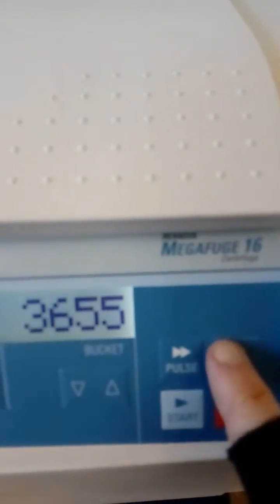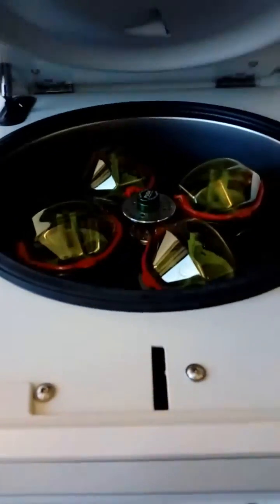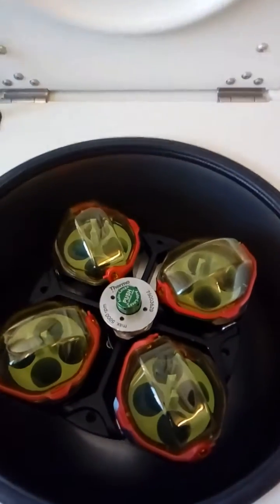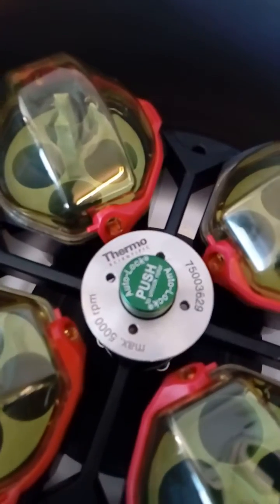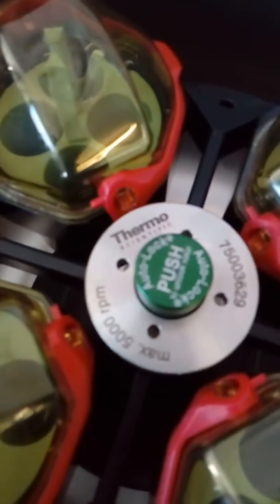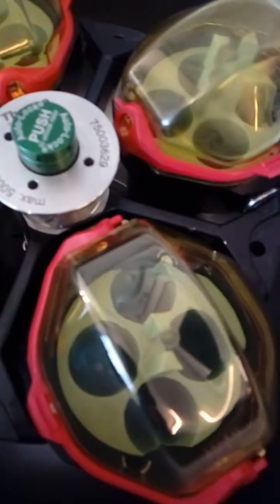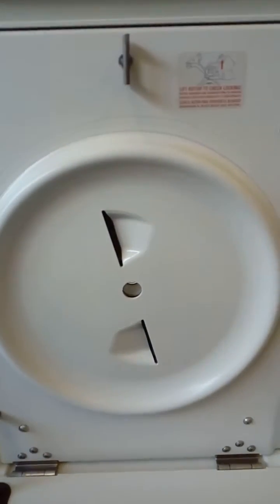I'll just open the lid to show you the interior of the centrifuge with all its rotors. As you can see, all the rotors are in place. The internal of the centrifuge is in excellent condition.